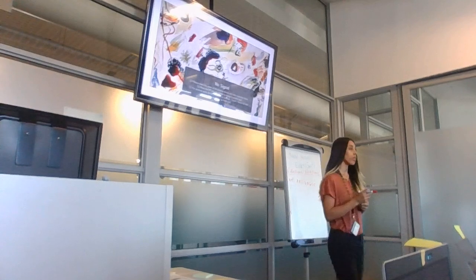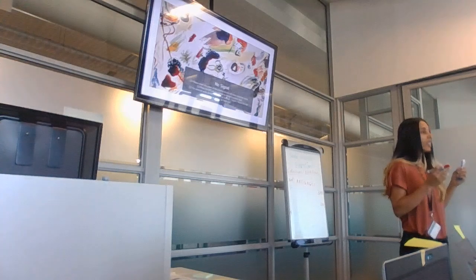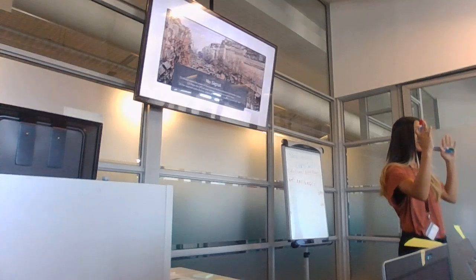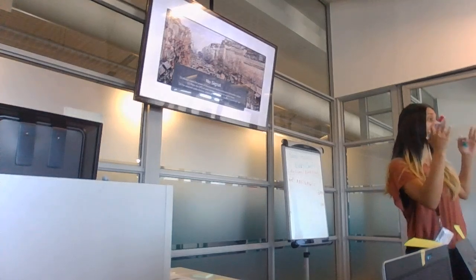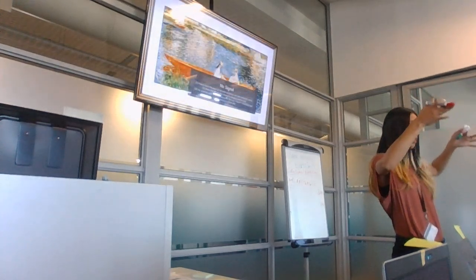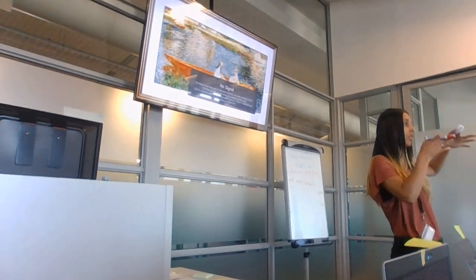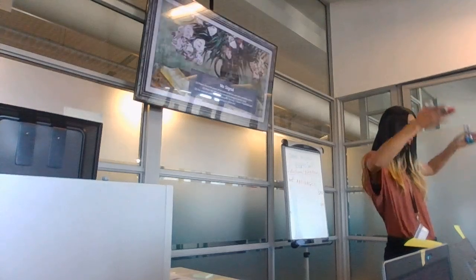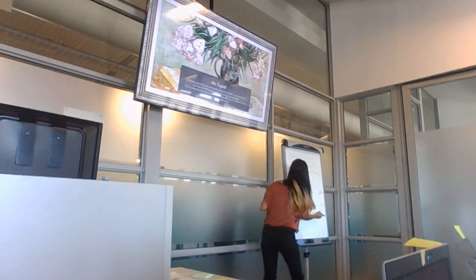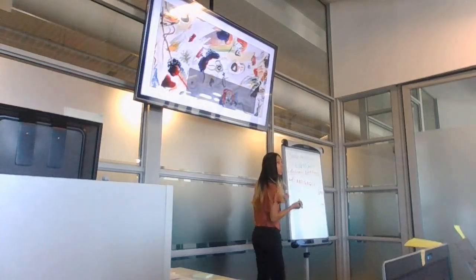So when it's bigger, in terms of length, they both cover the same thing. If your genome is 6 billion base pairs like human, they're both only going to sit within those 6 billion base pairs, but the forward may have more reads supporting positions in that same length. This file is not longer. The forward file is not like that and the reverse like that. They're both the same size.